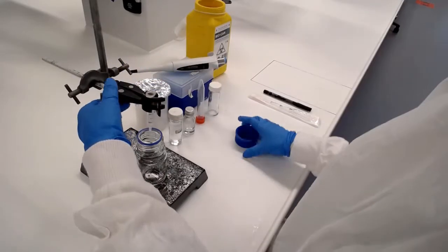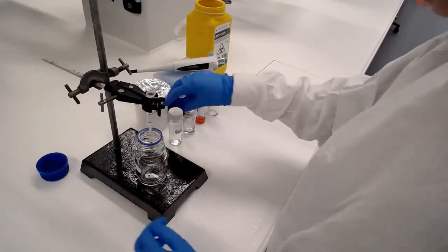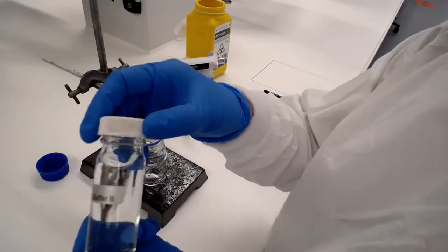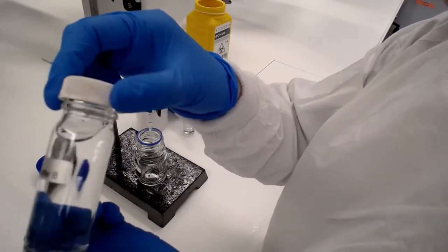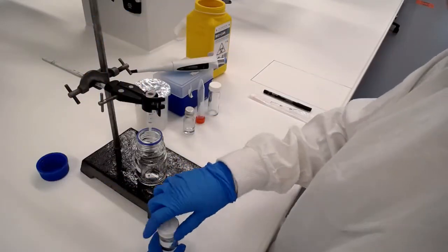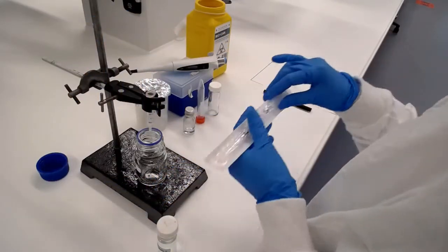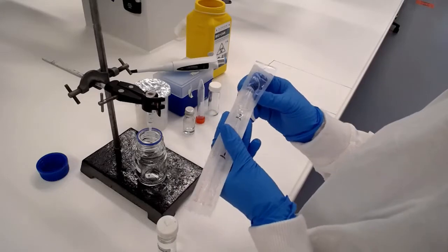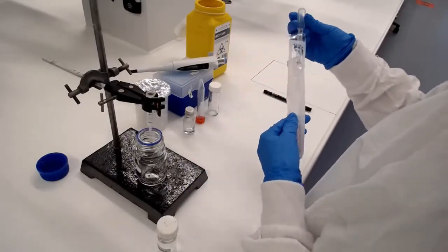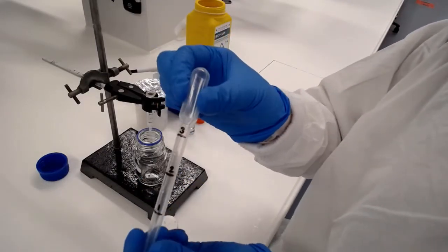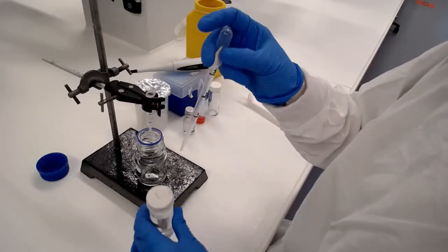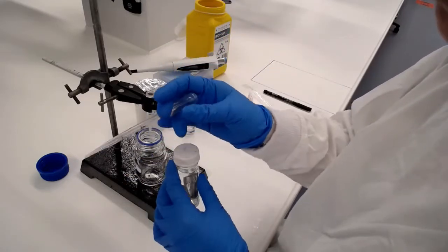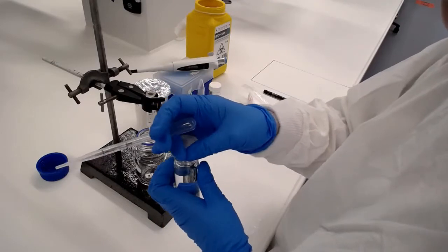Our first task is to equilibrate the column. For this we use buffer B, which is a low imidazole buffer. In the presence of this buffer our E. coli proteins should not stick to the column, but our protein of interest with the 6-his tags should stick. We're going to use a transfer pipette for this, also known as a squeezy bulb pipette.